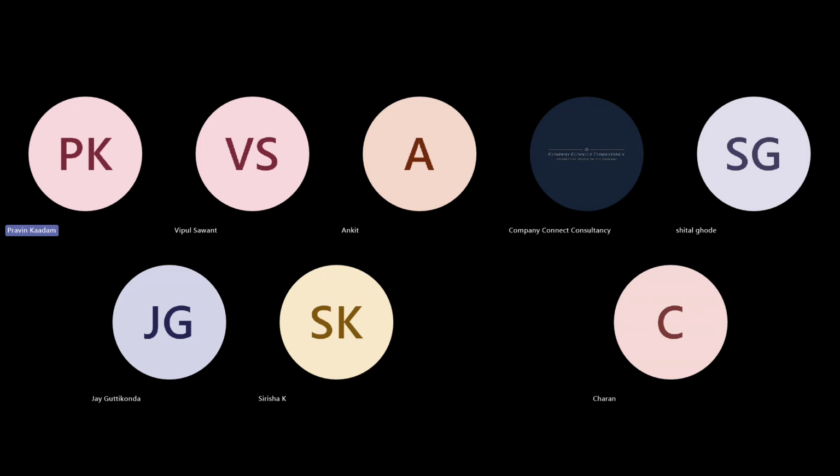What you can do is create some SQL query. You can ask your SAP team to migrate the data from SAP in the form of a text file, CSV file, or XML file, and then you can import that data into LabWare.